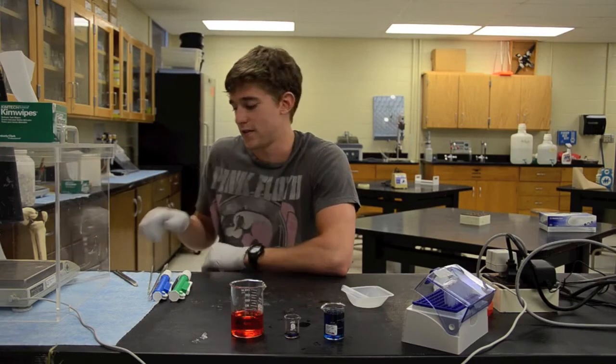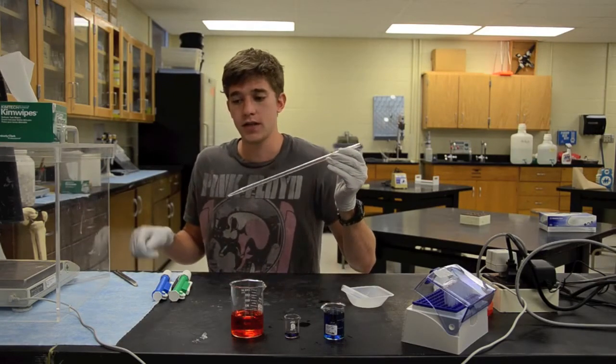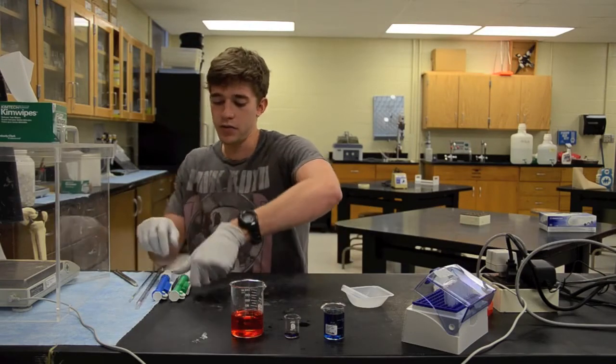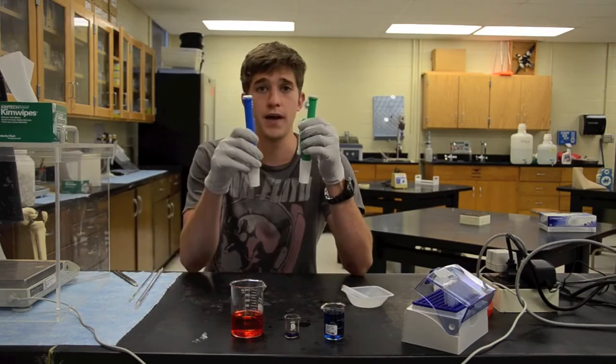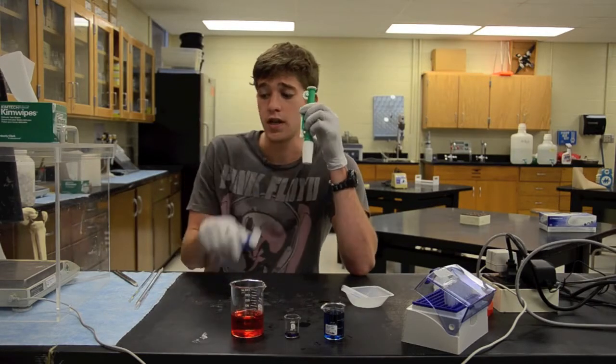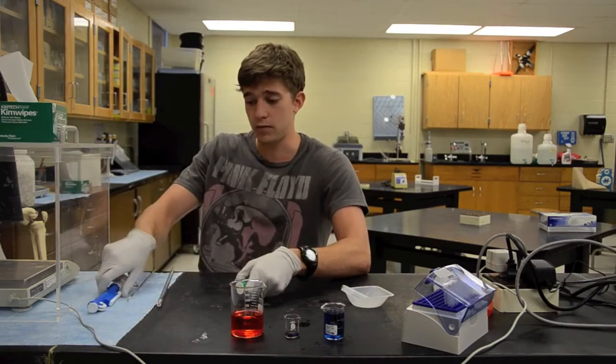When it comes to manual pipettes, we have two choices. A large one, which holds 10 milliliters, and a small one, which only holds 1 milliliter. Now to do that, we have two different color manual pipettes, a blue and a green. It's important to remember which one does which. The green connects to the large, the blue connects to the small.